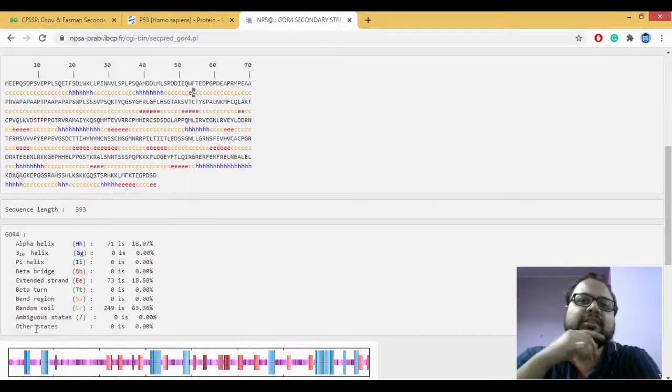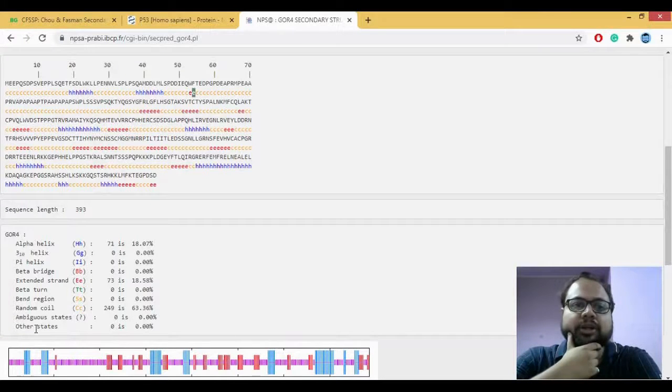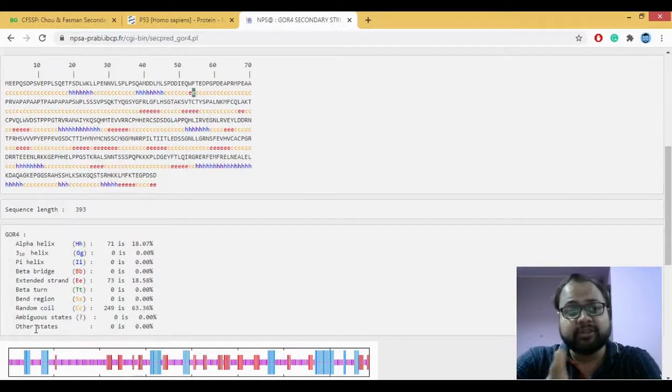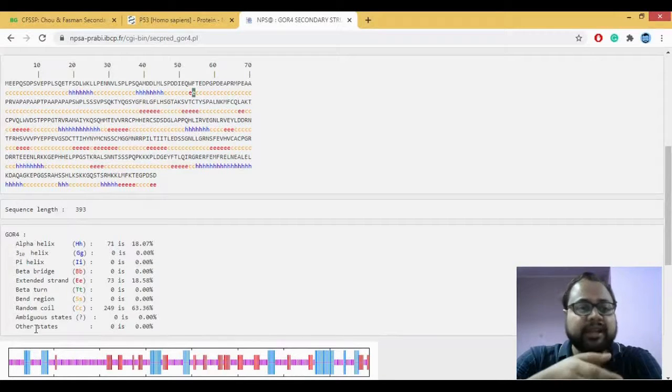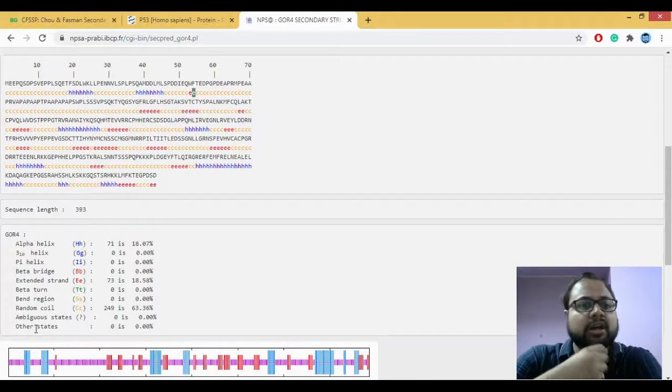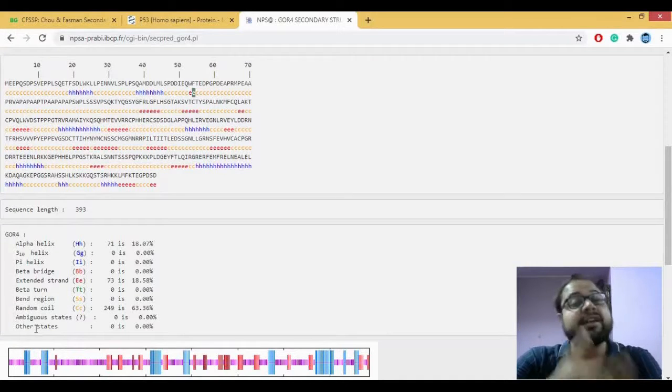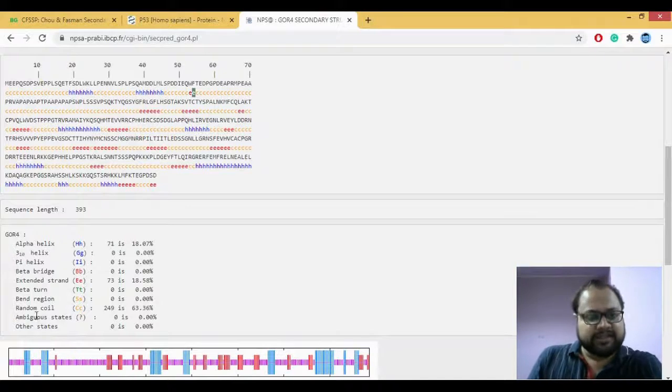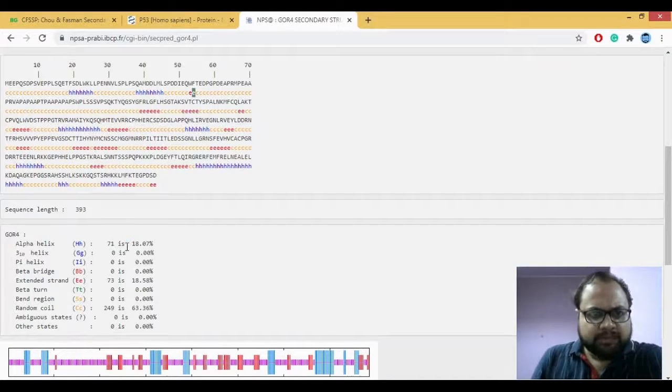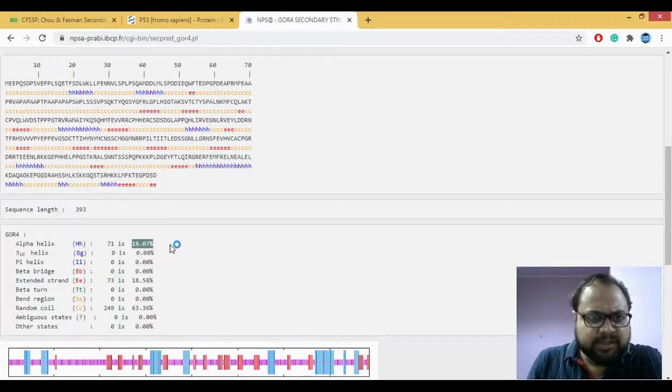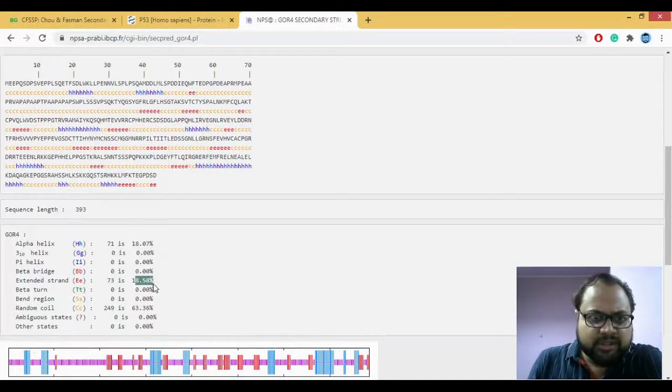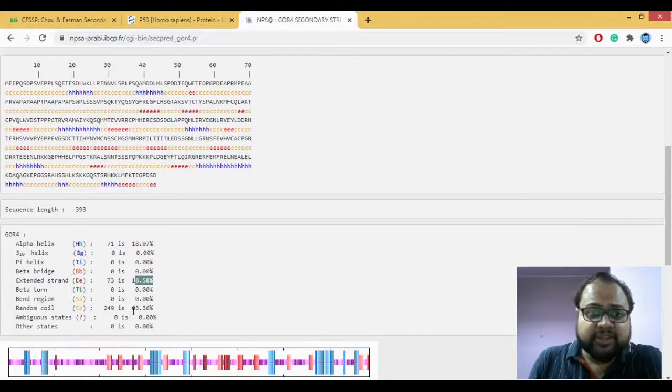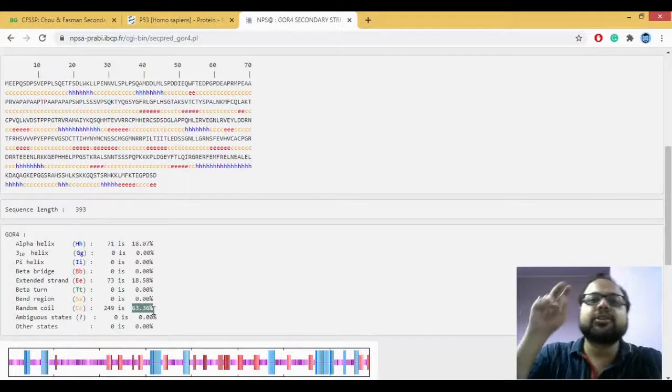If you look at the different types of the number of secondary structures which is actually predicted by it, it has alpha helices, it has beta sheets, it has extended turns, it has random coils also. So there are a lot of things which can be predicted. In this case if you can see it's predicting about 18 percent of alpha helices, 18 percent of your extended strand, that is your beta sheets, and here it's predicting 63 percent of your coil.